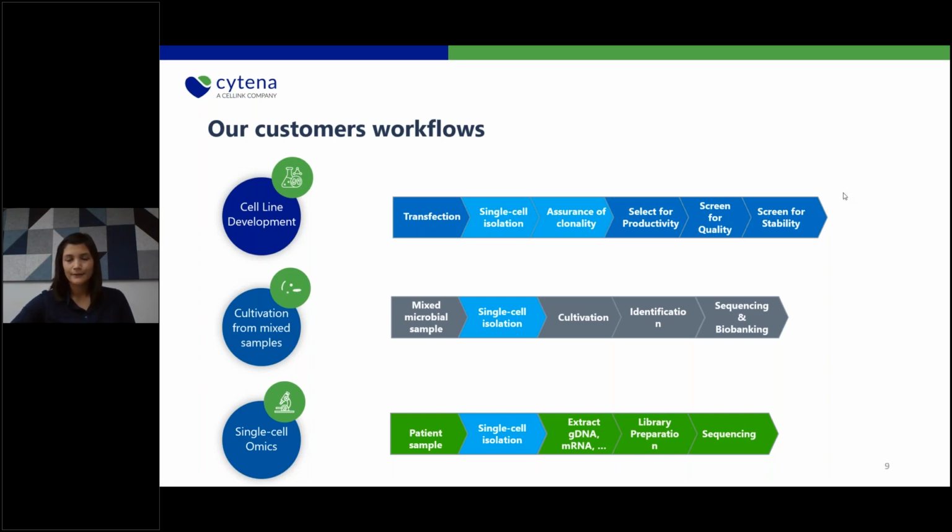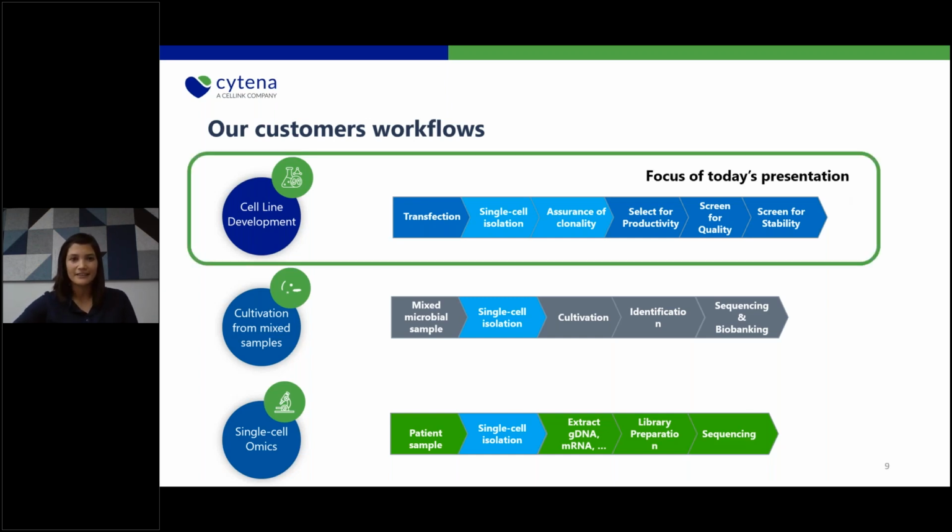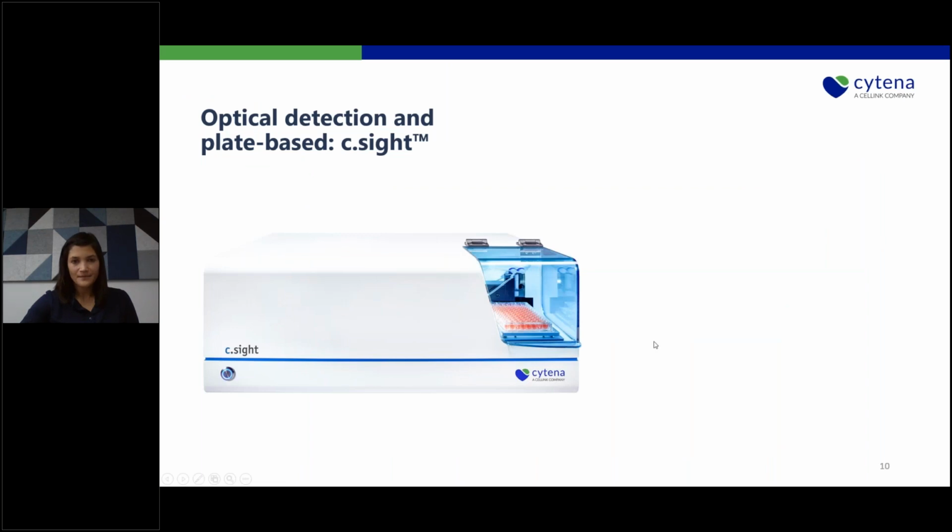So, like I already mentioned, today's focus is on cell line development. This is the main field where the C.SIGHT comes into action. So this is the device.